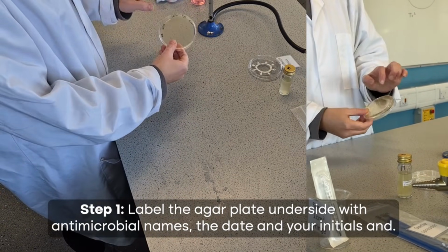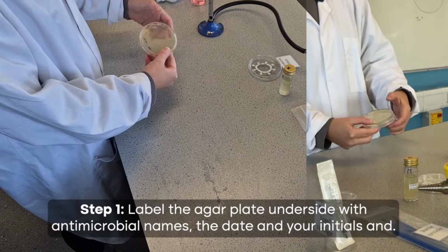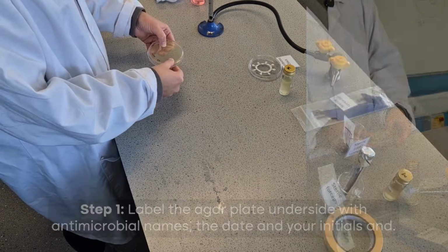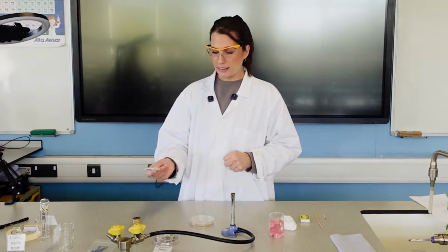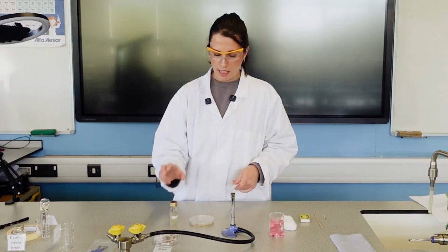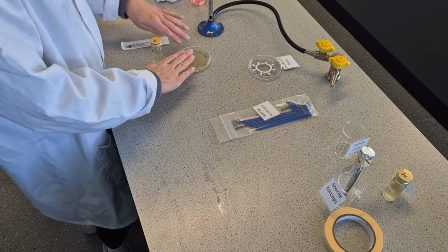So if the lid does fall off, we still know what is on the actual agar, and right at the edges so it's not blocking your plate and your results at the end. So now I'm ready to flip it over. So I'm now ready to get my bacteria from my bottle into my plate, and I'm then going to spread it evenly across the bottom.